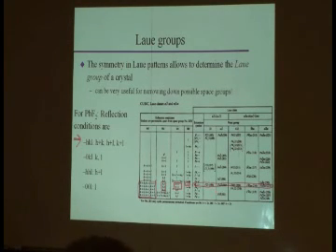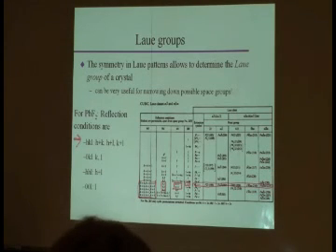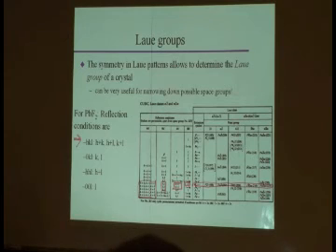Well, here's one way to help yourself. You figure out the Laue class of your crystal. That means instead of 5, you either have 2 or 3 left. In this case, we are left with 3, because we know that our Laue class is m3̄m. So it has to be F432, F4̄3m, or Fm3̄m. As a matter of fact, if you ever chose to look it up, PbF2 crystallizes in Fm3̄m. So that is how you can use these Laue photographs together with some systematic absence data to really narrow down your choices of space groups.